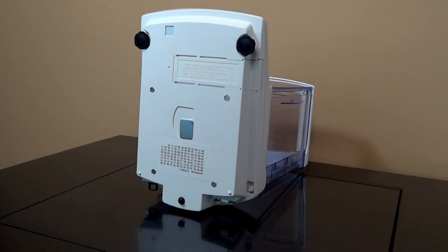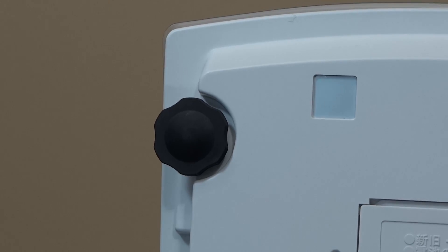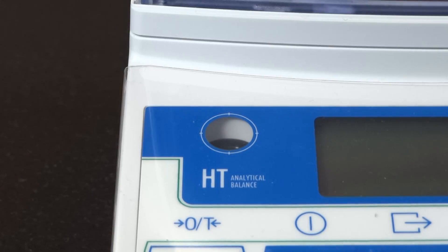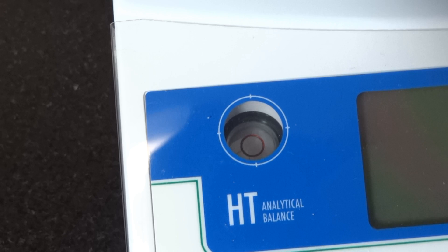Starting from the bottom of the balance, the HT has three support points, two of which are adjustable. There is a spirit level next to the display to help with leveling.